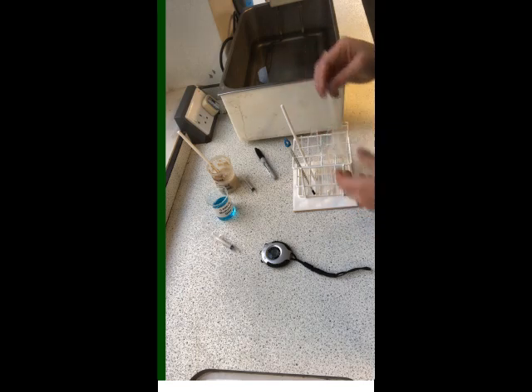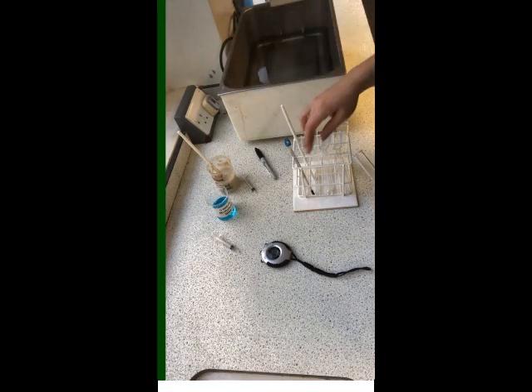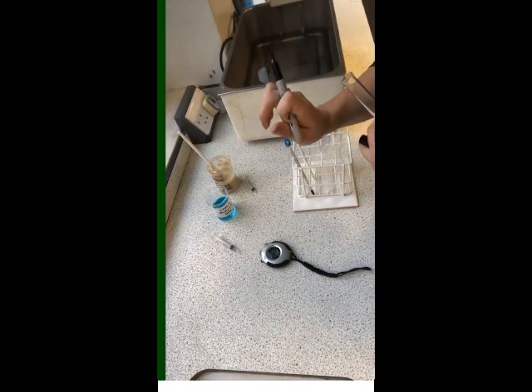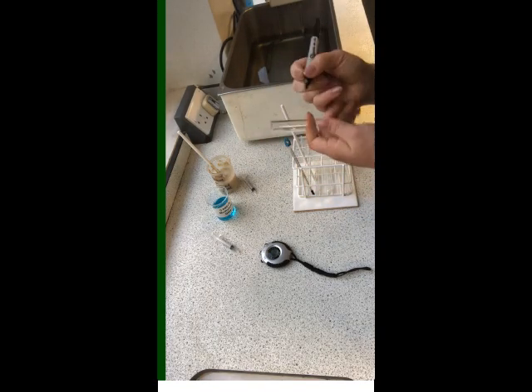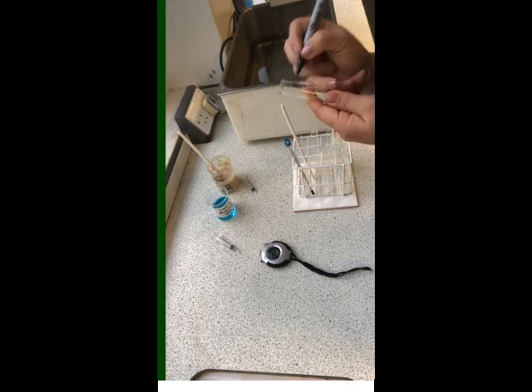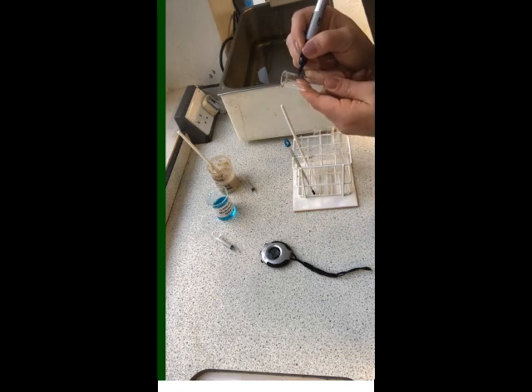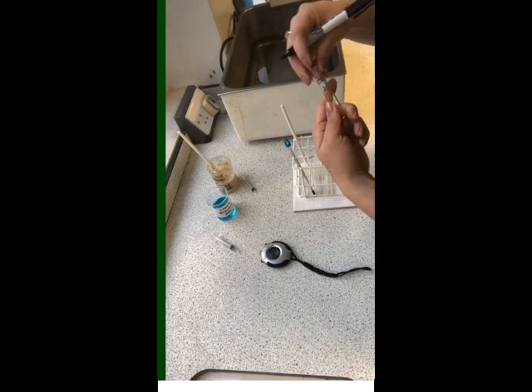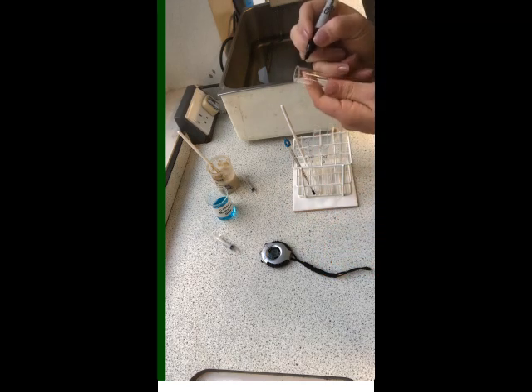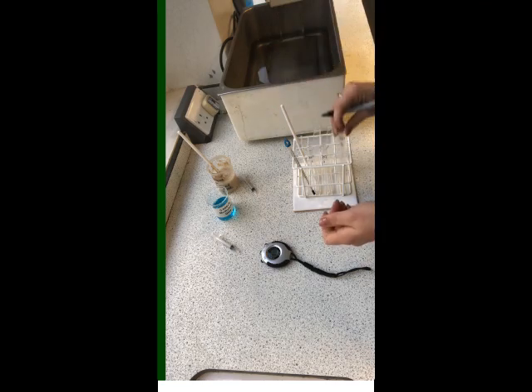So we have 6 tubes. We are going to do 2 temperatures, room temperature and the 37 degrees. And we are going to repeat 3 times. So each temperature repeated 3 times. So using a marker, I'm going to track my tubes. So this is going to be 23 degrees C, repeat number 1. 23 degrees C, repeat number 2, and 23 degrees C, repeat number 3.